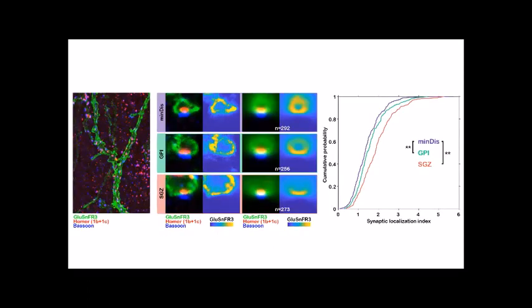And then when we took those winning constructs and did expansion microscopy on them, we discovered that those better performing constructs were indeed better nanoscopically localized to synapses, right? So this is the original parent. There's this slight dimming in these average images of the postsynaptic density relative to the other labeling, and you can just see that there's relative enrichment using this GPI or that stargazin-based backbone.